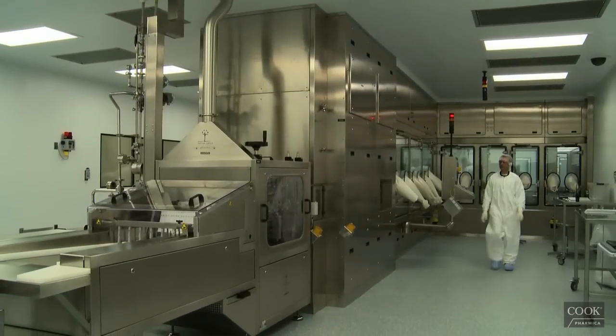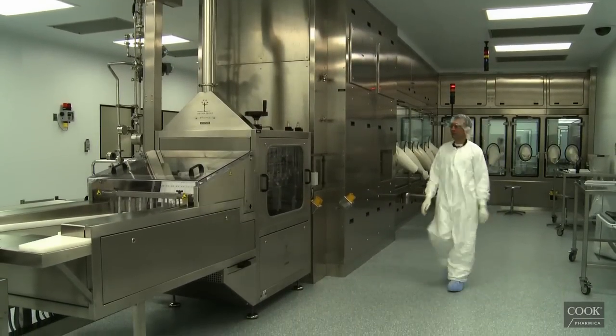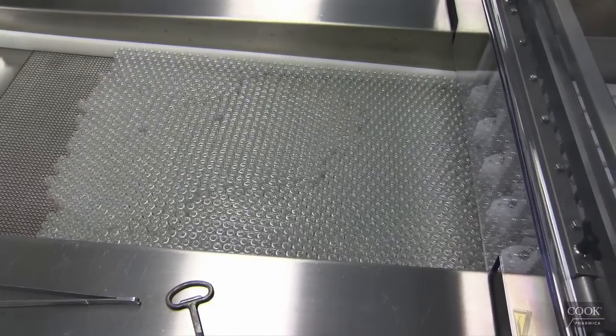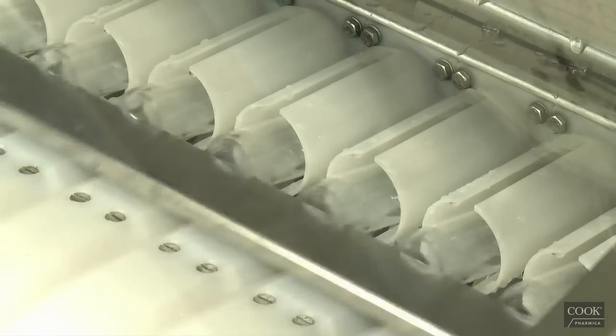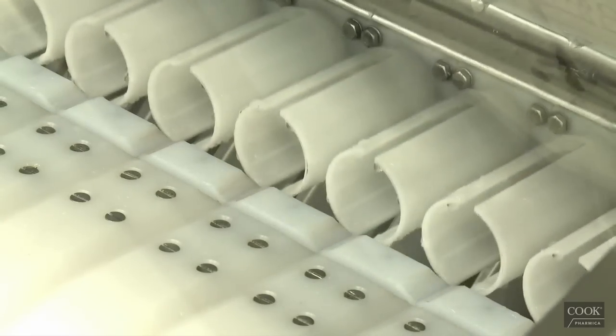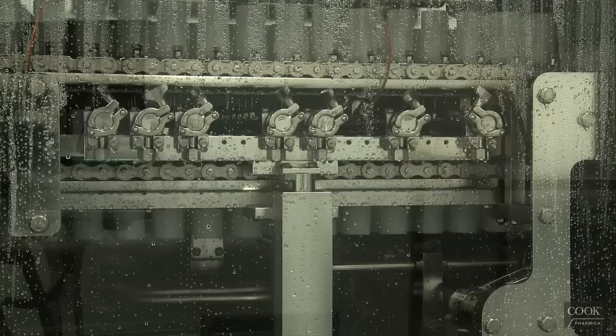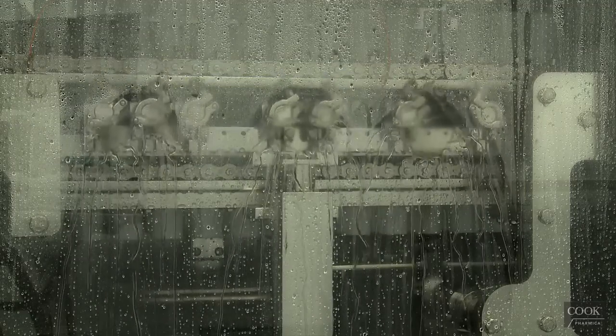The completely automated process starts by using an inline style vial washer. Ranging from 2 to 20 milliliters, up to 50 milliliters with change parts, the interior and exterior are washed and prepared for depyrogenation. The changeover for the vial washer can be completed in less than 15 minutes. It is all part of our turnkey approach that combines precision and efficiency.